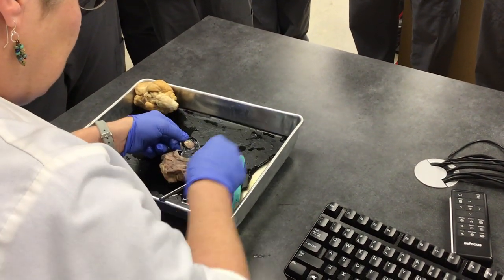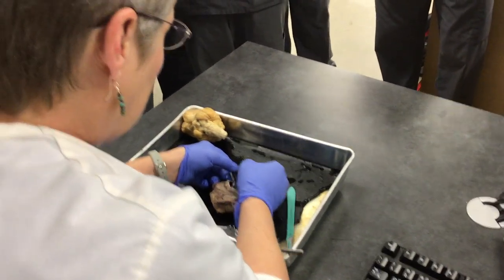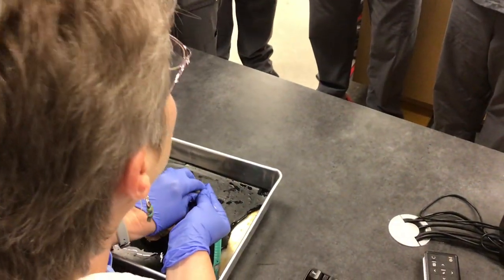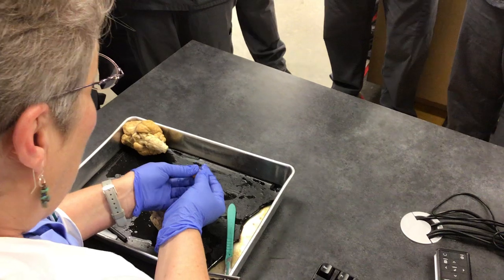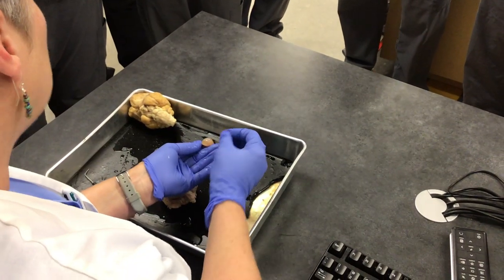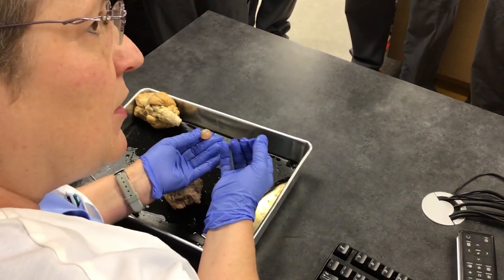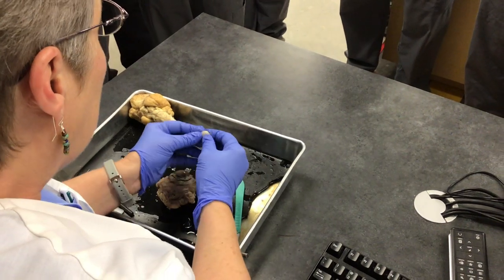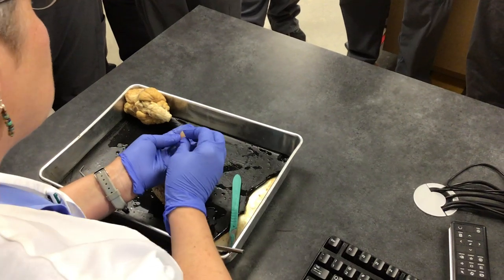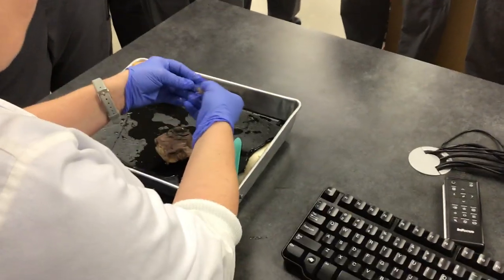Now we're going to look at the anterior chamber — what do you think this is? It's the lens. But in life, the lens is soft. In death, these proteins become denatured and it becomes very, very hard. You can cut yours open and actually see those proteins crystallized — that's what makes it so hard.